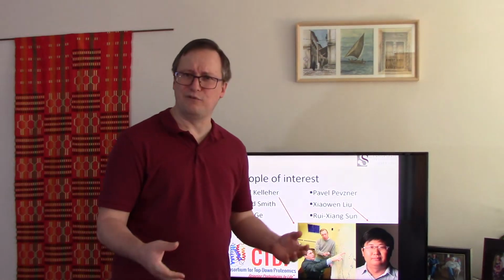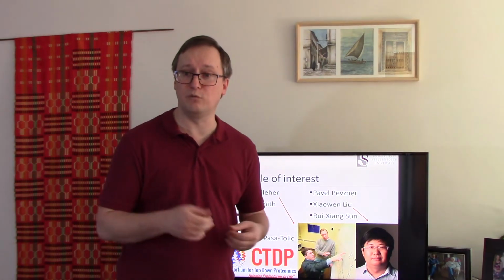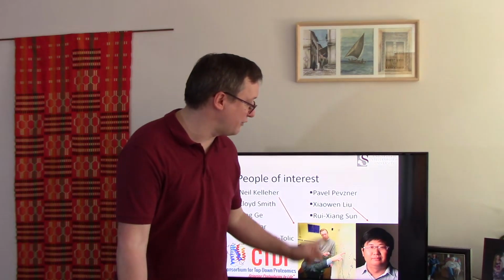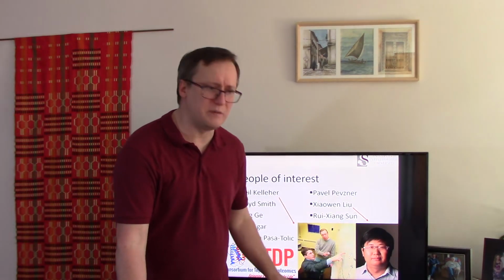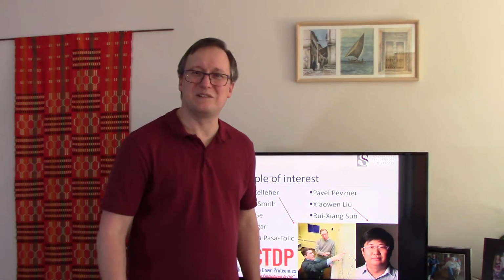I've mentioned Pavel Pevzner before in light of de novo sequencing in particular. He has also had a strong tie to the fine world of creating a home for things like MS-Align to be designed. I particularly give credit to Xiaowen Liu, who appears here at the bottom right. Xiaowen is not one of these noisy personalities out there. He's quiet and thoughtful, and I find that when I want to know what these tandem mass spectra represent for an intact protein, his software is what I always turn to. The man's really smart and has produced some very fascinating software.